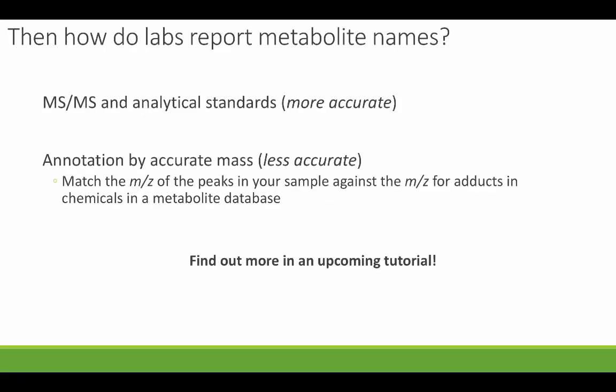The last thing you may be wondering is how labs actually report metabolite names. How do you actually get from the features or the peaks to metabolites? This will be covered in an upcoming tutorial where we'll talk about matching against analytical standard libraries, the process of going through MS, and then annotation by accurate mass.